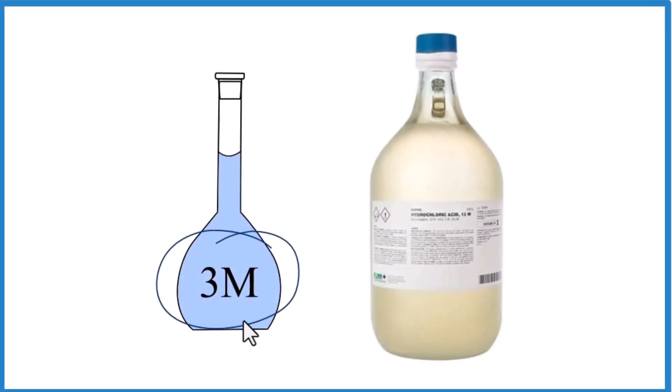If you need to make a three molar solution of hydrochloric acid, there are a few ways to do it. So let's take a look at that.